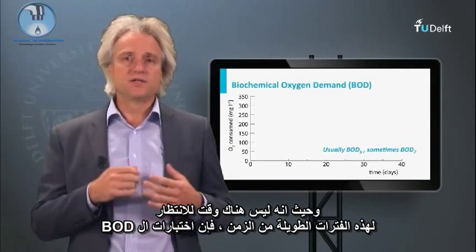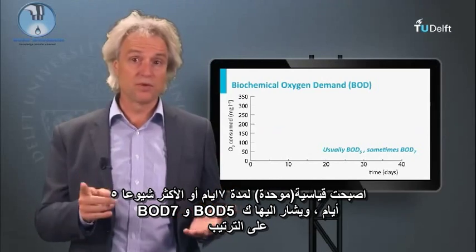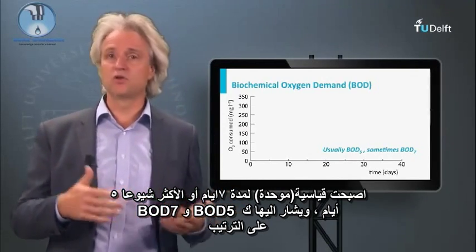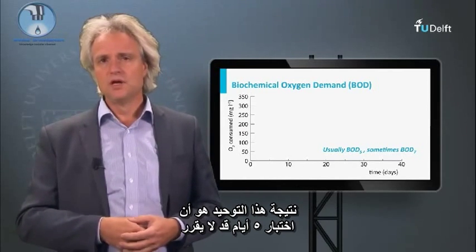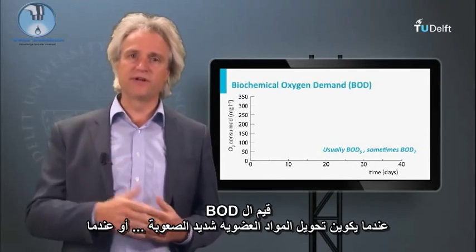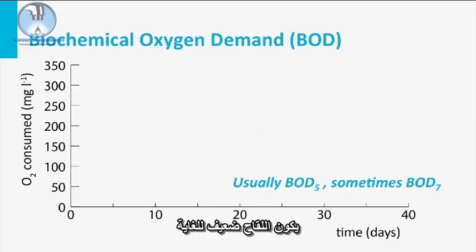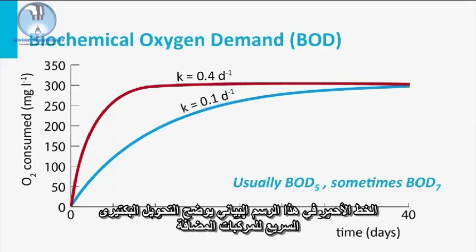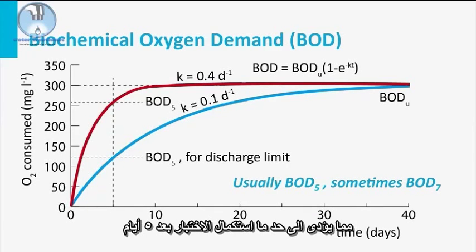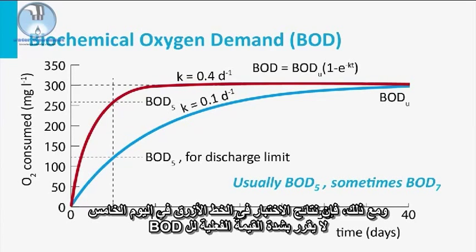Since in general there is no time to wait for such long periods of time, the BOD test is standardized to a duration of seven, and most commonly to five days, indicated as BOD-7 or BOD-5, respectively. The result of this standardization is that a five-day test may underestimate the actual BOD values when the conversion of the organic compound is more difficult or when the inoculum is very poor. The red line in this graph shows a rapid bacterial conversion of the added compound, resulting in more or less completion of the test after five days. The BOD-5 is here a good estimate of the actual BOD value. However, the test results of the blue line at day five severely underestimates the actual BOD value.